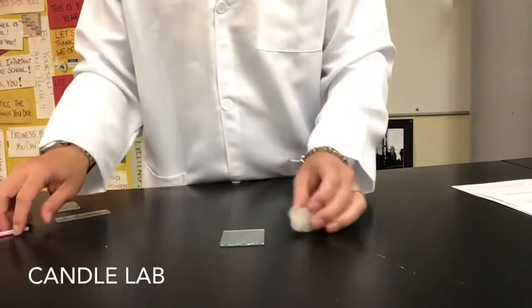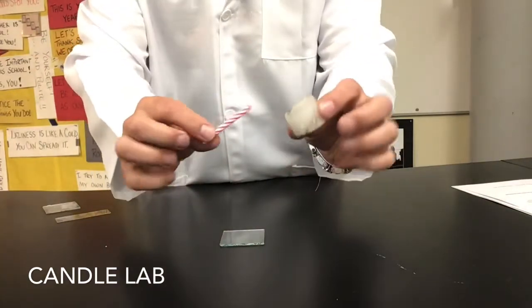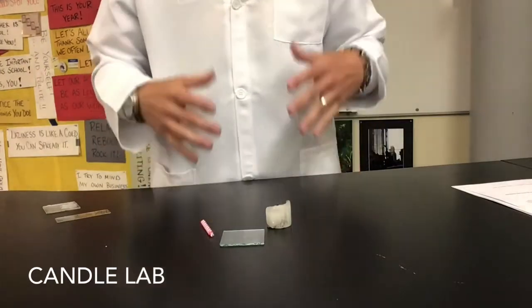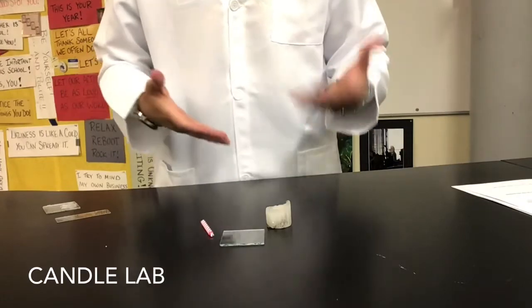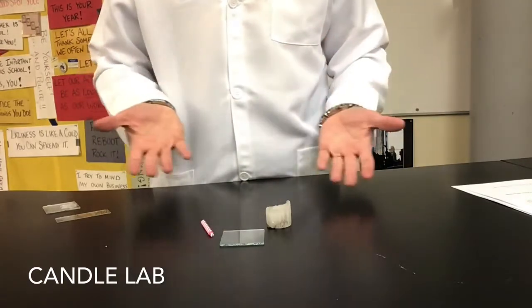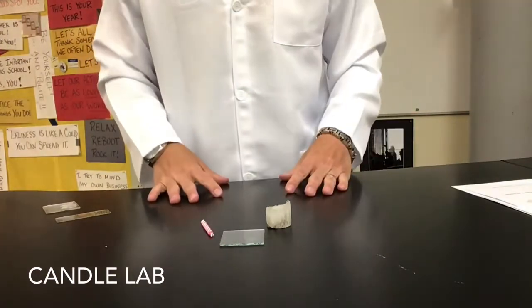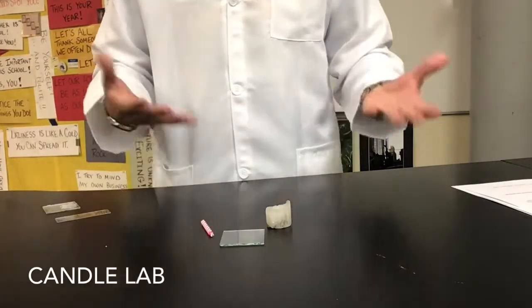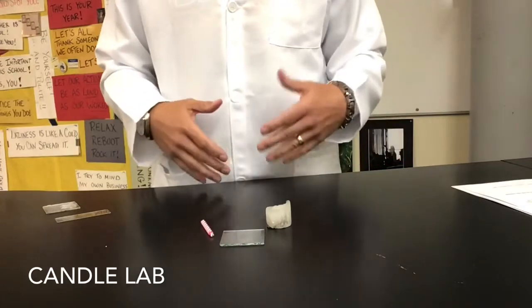So we're going to be looking and trying to figure out kind of what exactly allows a candle to work. Now, this is one of our first labs, so we're going to focus on observations. And when we write down observations, the way you describe something and I describe something might be slightly different. So we want to make sure that we're descriptive when we write, so that we both can understand what each other is seeing.